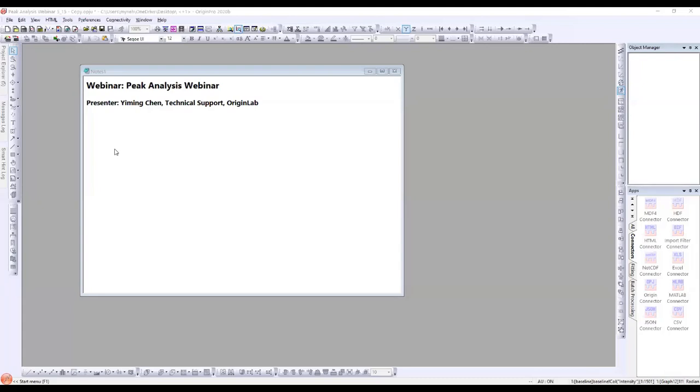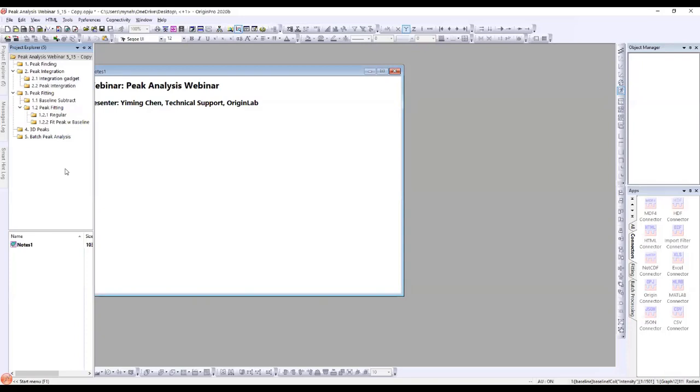In this webinar, I'm gonna give you a presentation on the peak analysis tools in Origin. By going through some real world data, I'm going to cover the topics of peak finding, peak integration, peak fitting, 3D peak fitting, and batch peak analysis. So hopefully this webinar will be helpful with your research.